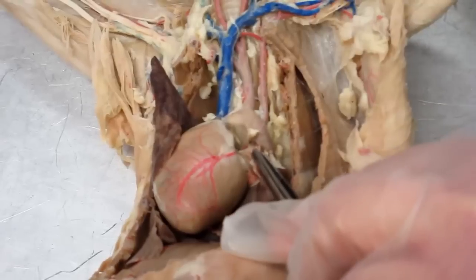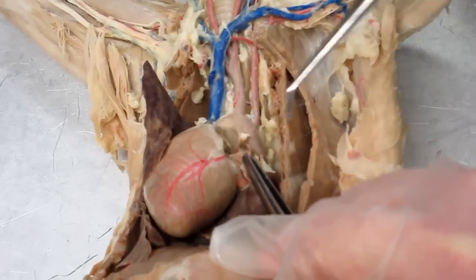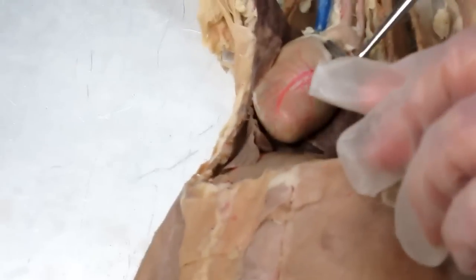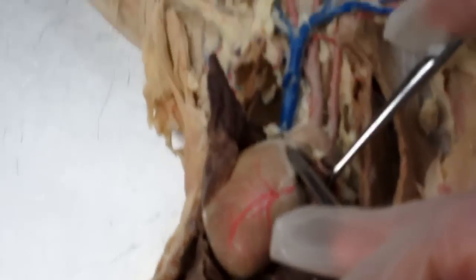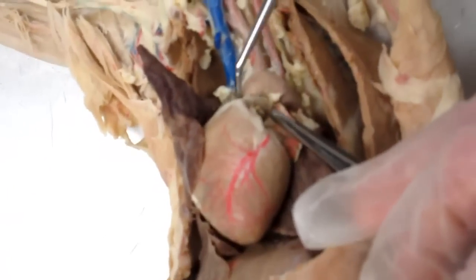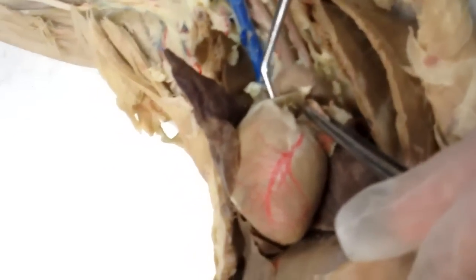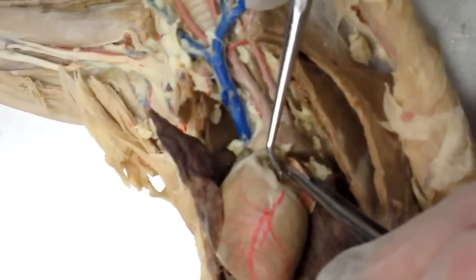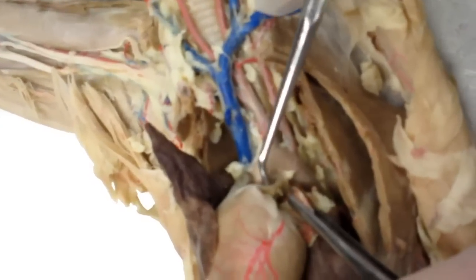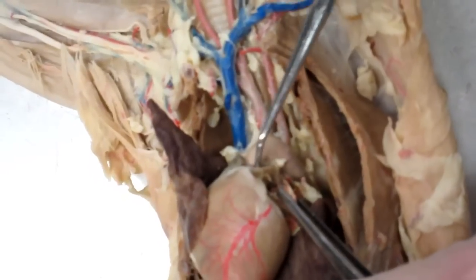And then I'm moving the auricle of the left atrium so that we can see this vessel that I'm grabbing right now, and that is the pulmonary trunk. It's kind of deflated here, but you can see that it has what looks like a little bit of blue latex in it. And we'll look at the other cat in a minute. I think it has a little better example.